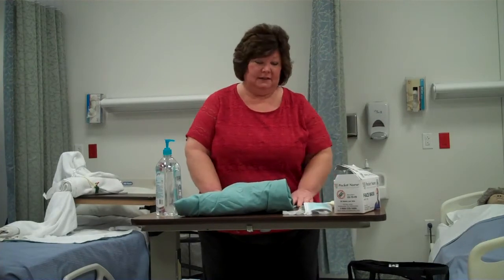Hi, today I'm going to show you how to gown up to go into an isolation room. You need a gown, a mask, and gloves.